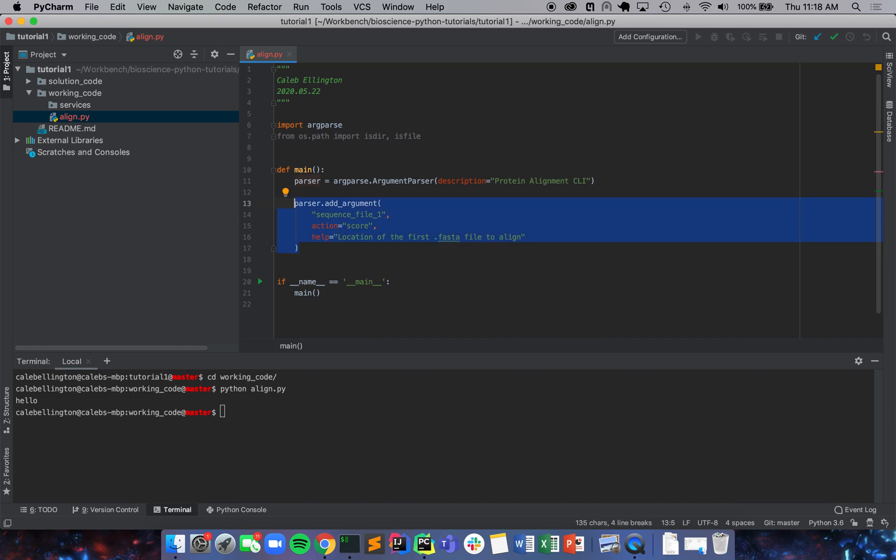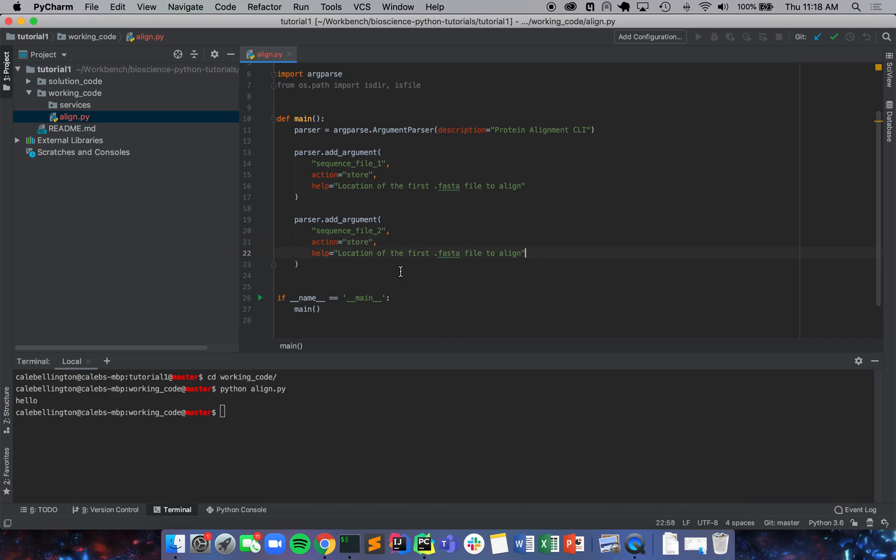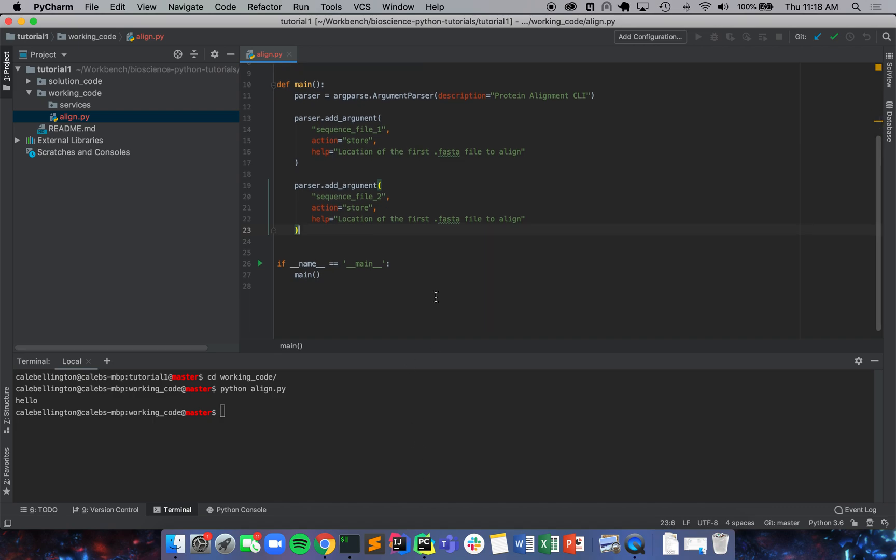And then we also need a second file for our second sequence. So we're just going to take that and copy and paste it down here. Sequence file two, we're going to store that, and it's going to be the location of the second file. And that should be it for now.